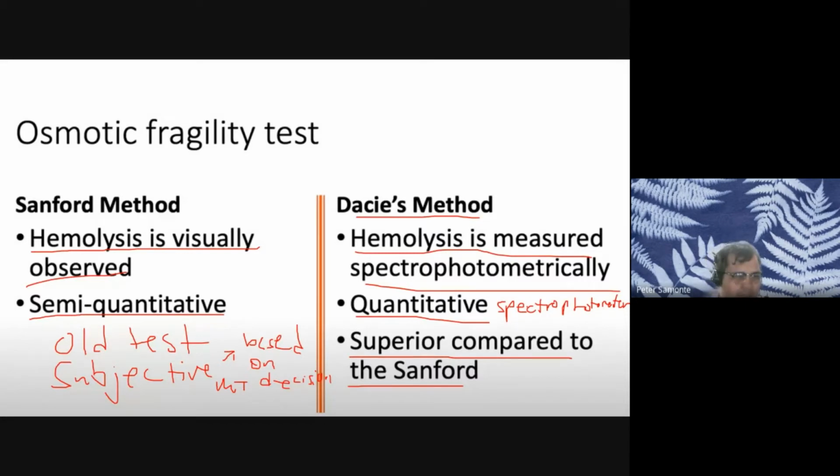If you're going to run a sample for your spectro, what do you feed first? Okay, very good. The blank. So do remember the blank, class.